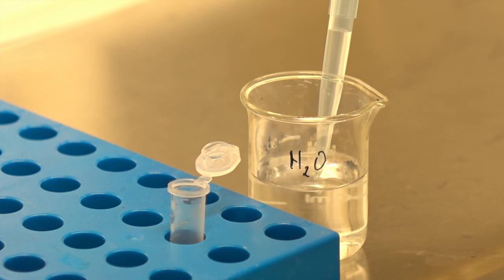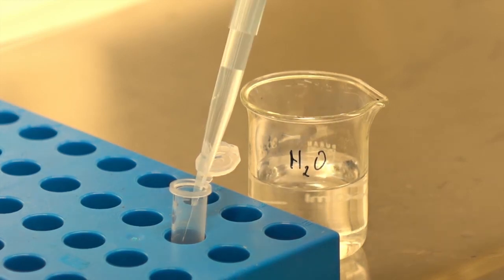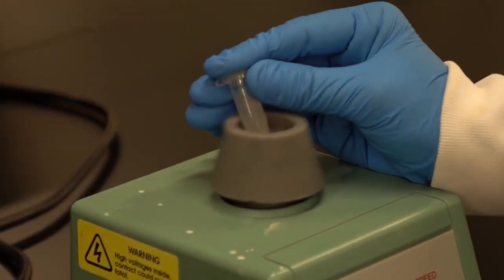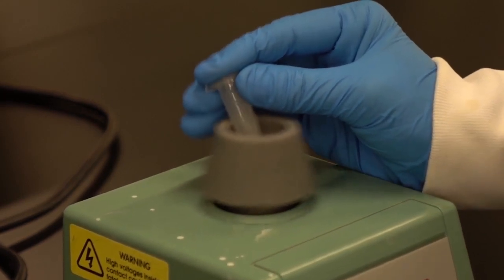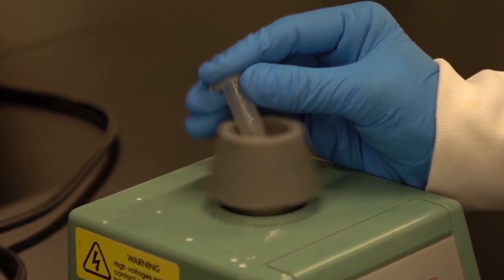Add one milliliter of ultra-pure water to the tube and vortex for one to two minutes until the collected bacterial pellet is no longer visible at the bottom of the tube.